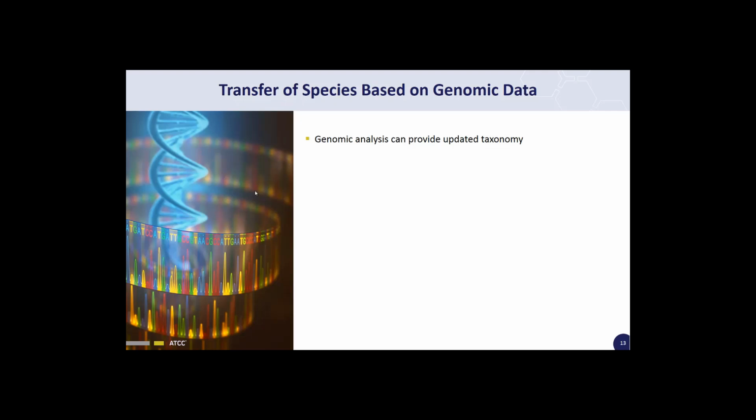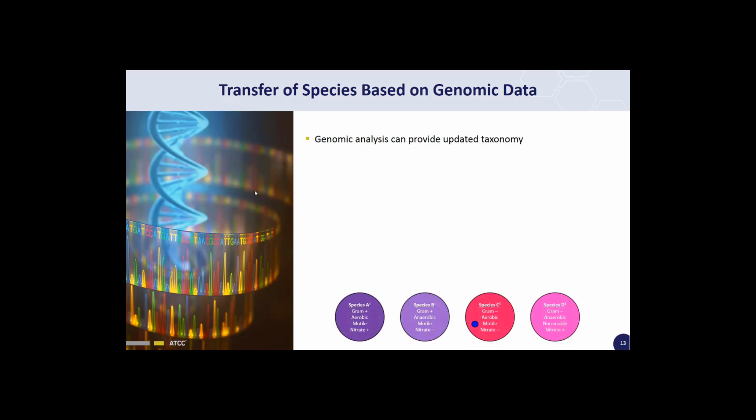Sometimes the genomic data can provide a more modern look at older historical strains. A strain that was once believed to be one species may turn out to be a different species. Let's look back at our simple example from earlier, where we have 4 type strains and 1 isolate that we identified as species C. From the phenotypic characteristics we observed, that identification appears to be correct, but we can enhance our investigation by using dDDH to examine the genomes of these strains.